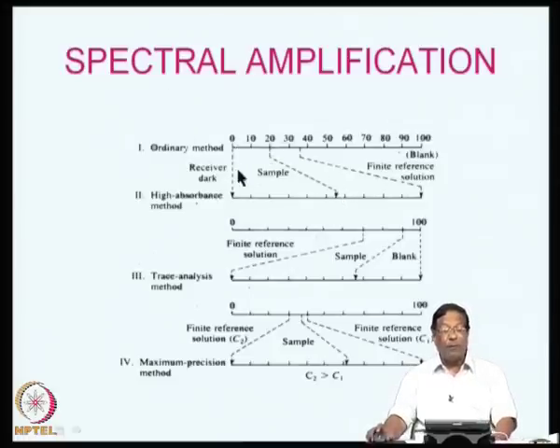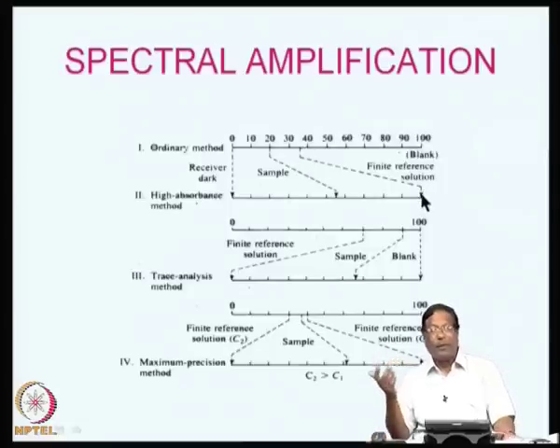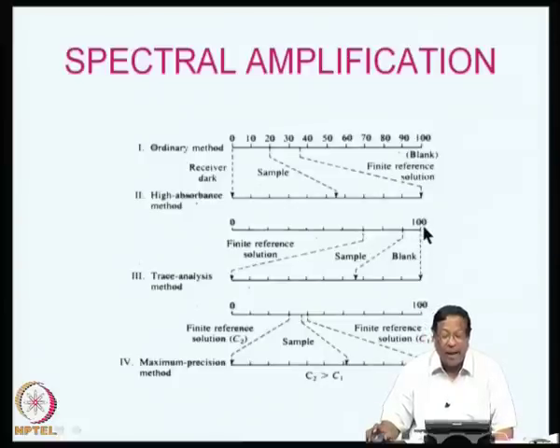So, 0 is always 0. I am expanding the scale from somewhere around 35 to read the full scale, that is absorbance, by opening the slit more. So, if my sample is somewhere around 20, it will cover the whole range, but appear somewhere here. Similarly, if the substance is at very low concentration, then I adjust the 100% transmittance and 0% absorbance. So, my sample is my standard, I allow it to go up to this point and 100% is same, and in between my sample is there.